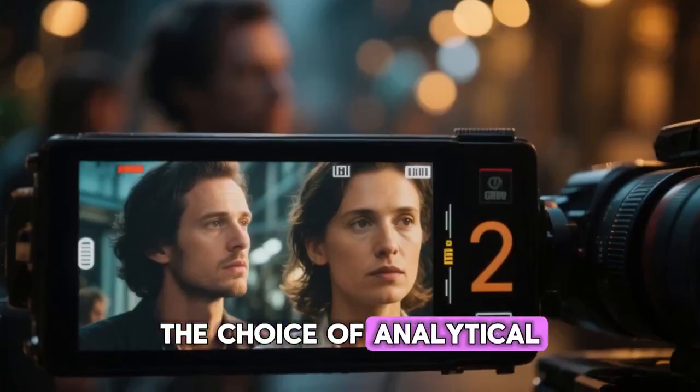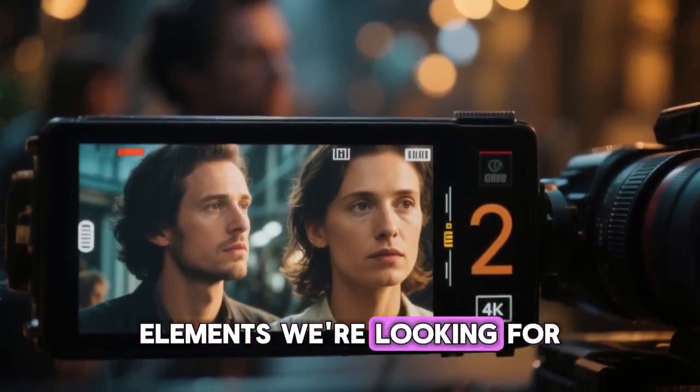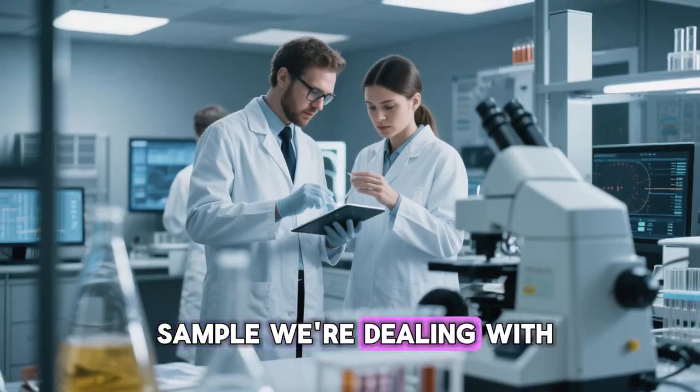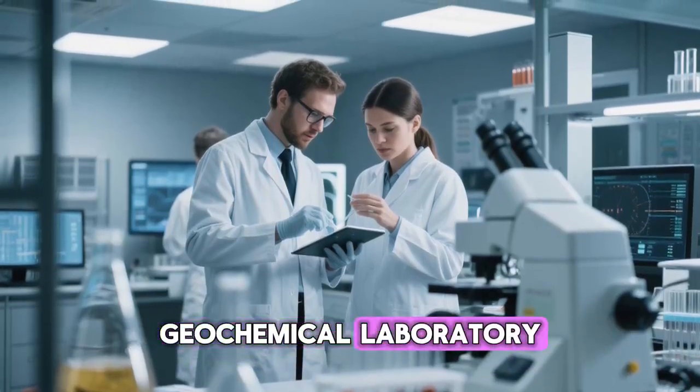The choice of analytical method is critical. It depends entirely on which elements we're looking for, the detection limits we need, and the type of sample we're dealing with. So, let's get started on our journey through the modern geochemical laboratory.